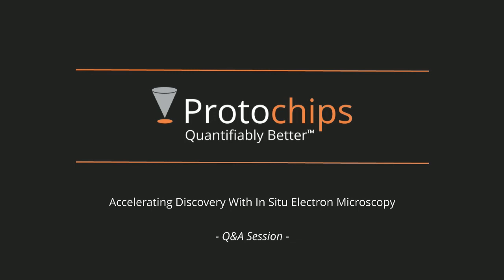Okay, another question for Ray, asking whether you could see single dopant atoms stabilized within pores in the monolayers of 2D materials. That's an interesting question. I think by definition, if you have a pore, there's nothing there, so it's really hard to stabilize. However, when we do some of these experiments, we have a thin layer of amorphous material that we can sometimes see single atoms positioned in. So, for example, if we're etching away the material and we create this little nanopore, there's a really thin layer of amorphous junk, I guess, left behind that we can see single atoms on. But if you don't have anything to support it, it's very difficult to have a dopant in there.